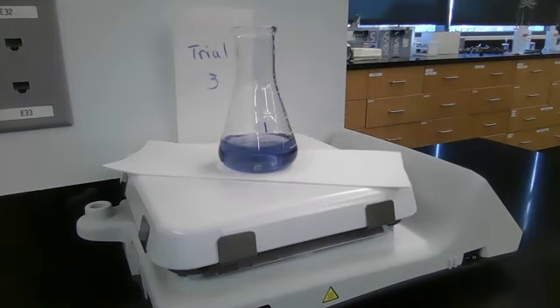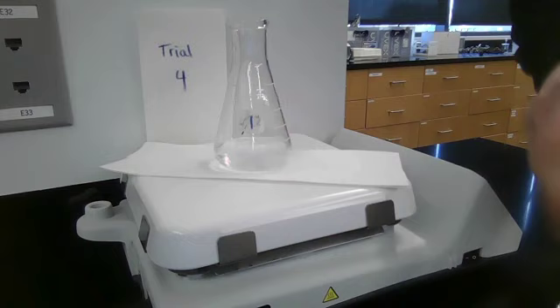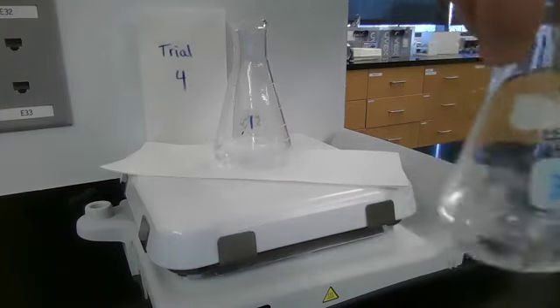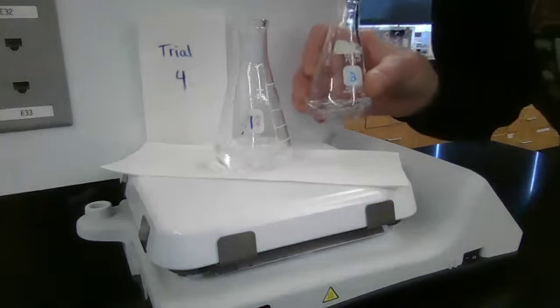That's right. This trial 3 is looking, iodine plus starch looks pretty good at the beginning, and then it looks like this after a while. Not edible at any stage, actually. All right. Swirling the starch, making very dilute gravy.